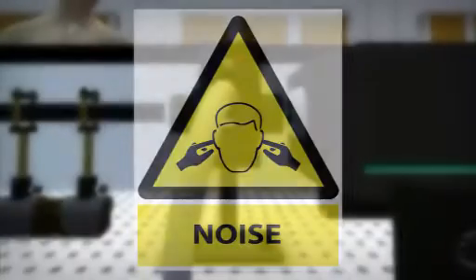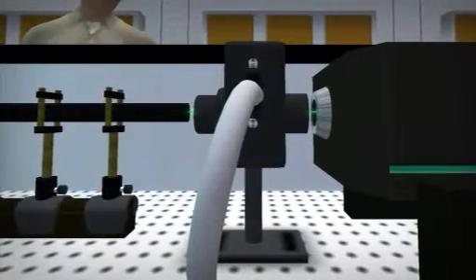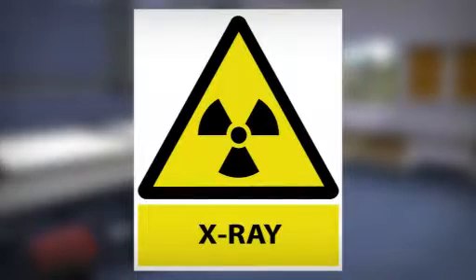Stored energy. Pulsed lasers often use capacitor banks to provide the energy, which produce pulses of light to pump the laser. These stored energy devices can be a significant hazard, even when disconnected from the electricity supply. Noise. Powerful lasers also pose a noise hazard that could potentially impair a user's hearing. Noise often causes difficulty with communication in the lab. X-rays. Some high-powered lasers can generate X-rays when directed at certain materials. Shielding is often used to reduce radiation exposure.